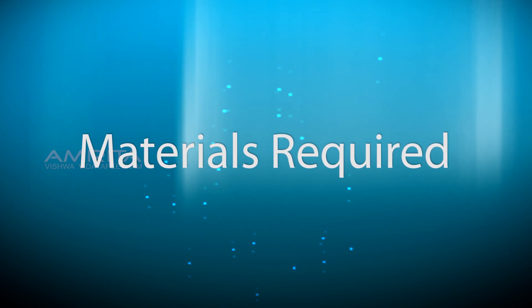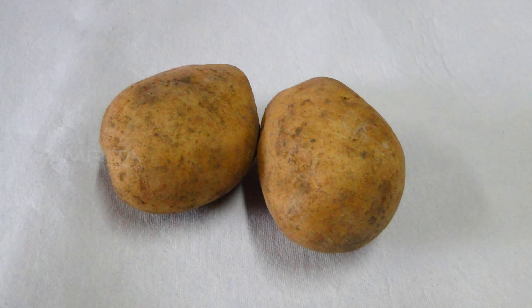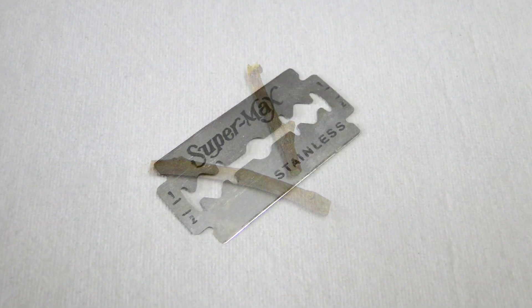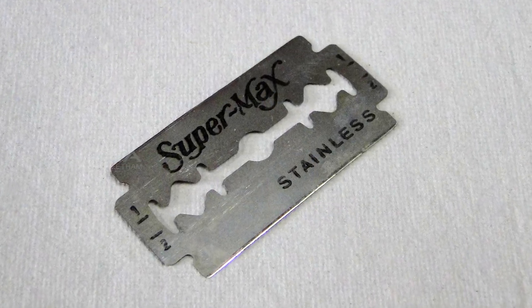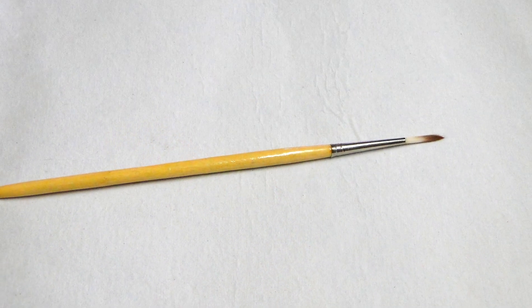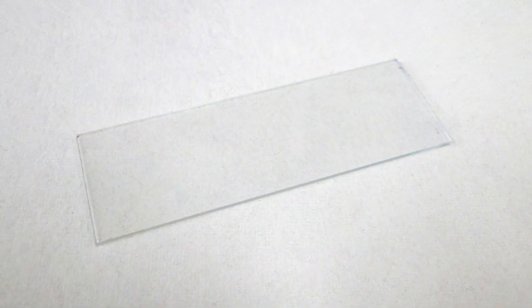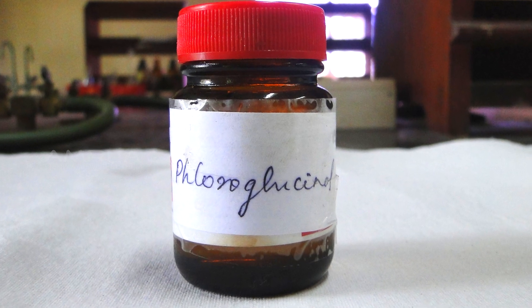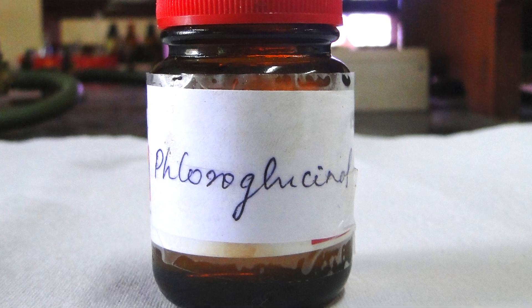Materials Required: Potato, stem of the plant, double edged razor blade, water, dropper, brush, glass slide, blotting paper, phloroglucinol stain, and petri dish.